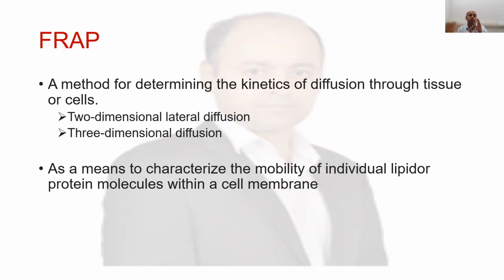Most of the transmembrane proteins will be fixed, but the proteins which are in the superficial layer are typically mobile. So it will tell us about the nature of the protein, whether it is traversing the whole membrane, and from that we can extrapolate the type of functions in which the protein can participate.